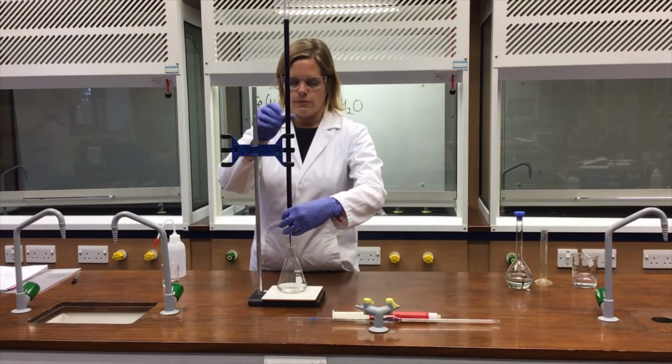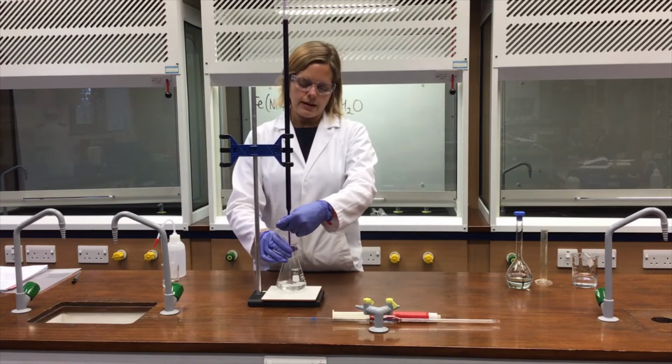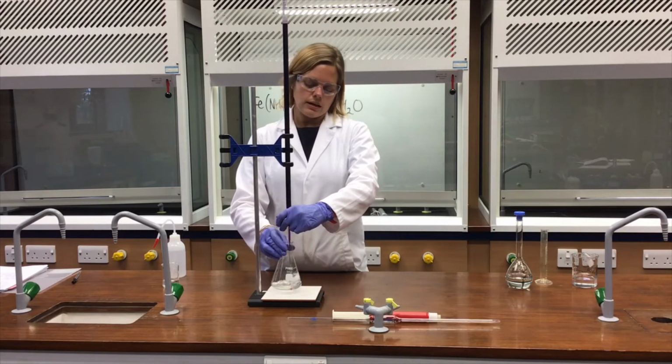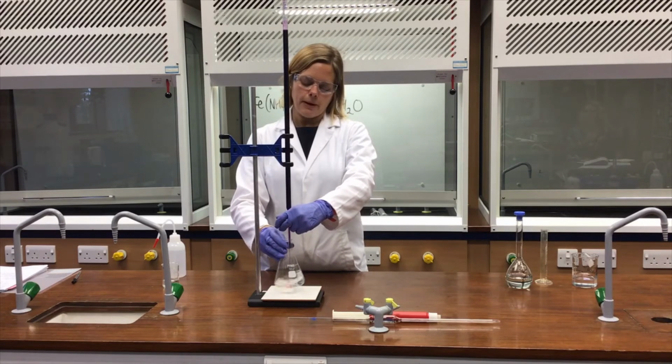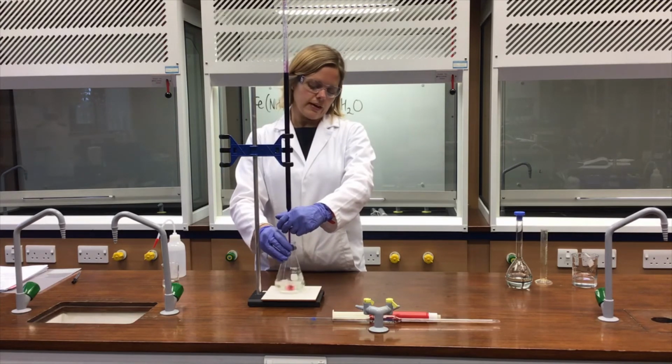And I'm going to swirl it with my right hand and add this solution with my left. Now, hopefully, what you should see is the colour change. So this very deep purple solution is instantly changing to a very, very pale green, but to all intents and purposes, colourless solution as it reacts with the Fe2+ in that solution. So keep swirling until we get a first permanent pink colour.